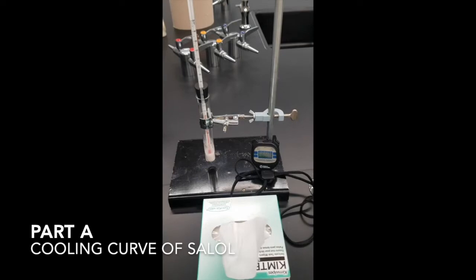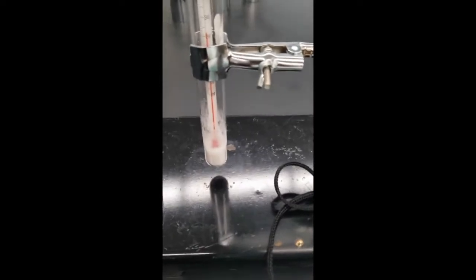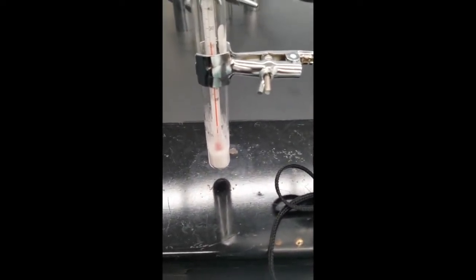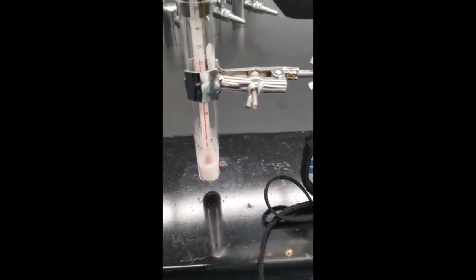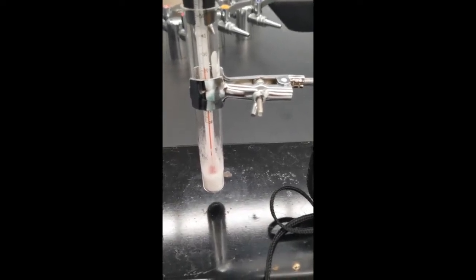In this part of the lab, we will create a cooling curve for Salol. Now, Salol is this solid we have here in this test tube, and you'll see that it has a pretty interesting cooling curve, and hopefully you might even see some supercooling. Anyway, that's what it looks like as a solid.